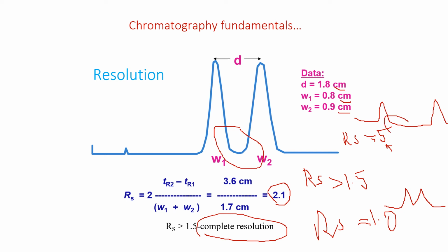This kind of resolution will take up the time. Remember, we want the optimum time for it. So if you ask me, do we want 5 or 2.1, I would choose 2.1, because I want to save time.